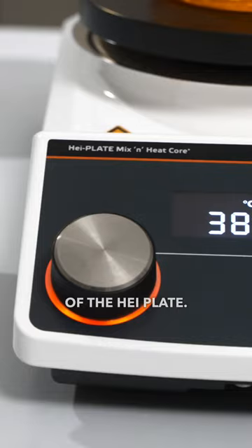It still continues to have the fast versus precise heat-up mode, so you can have better control of the heating of your process.